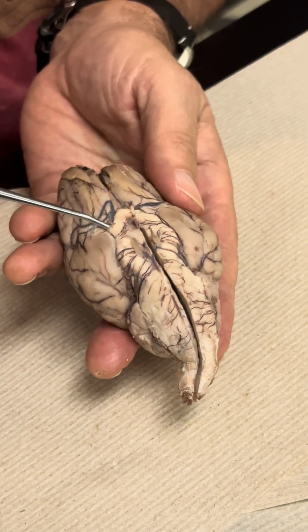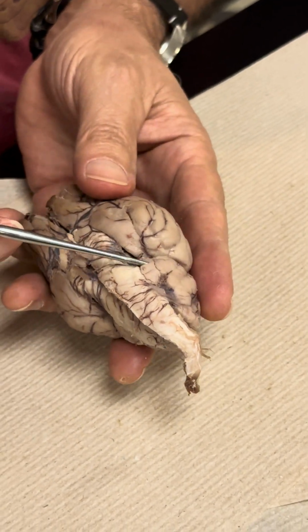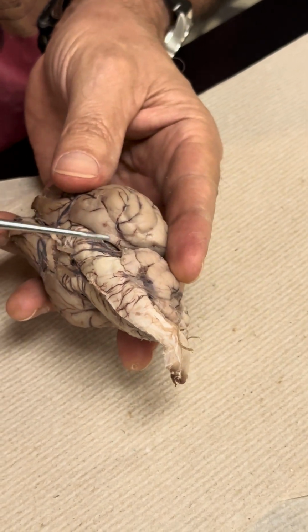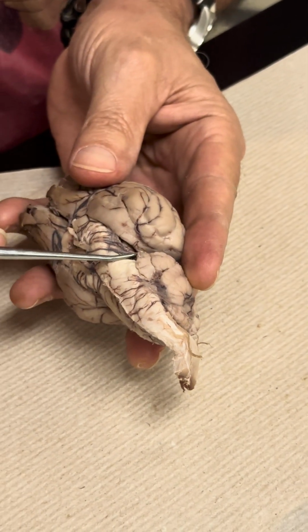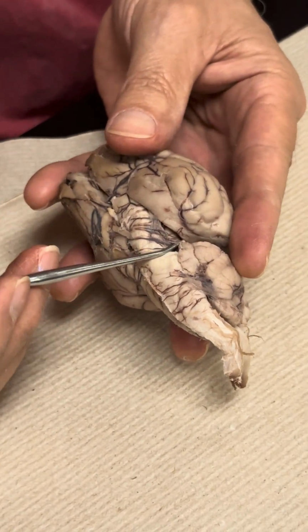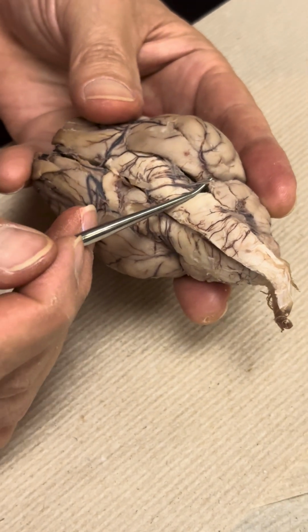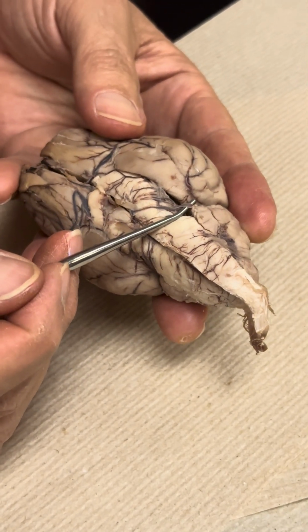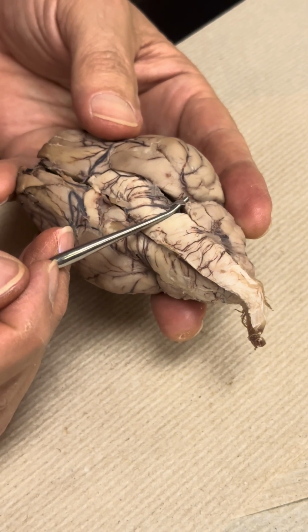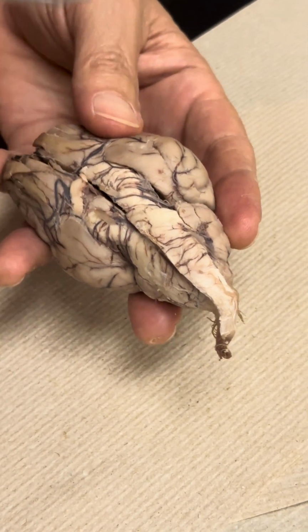They're ribbon shaped. Cranial nerve number 4 is the trochlear nerve, and it's very thin, comes out of the ditch between the midbrain and the pons. Trochlear nerve. Both of those nerves move the extraocular muscles.